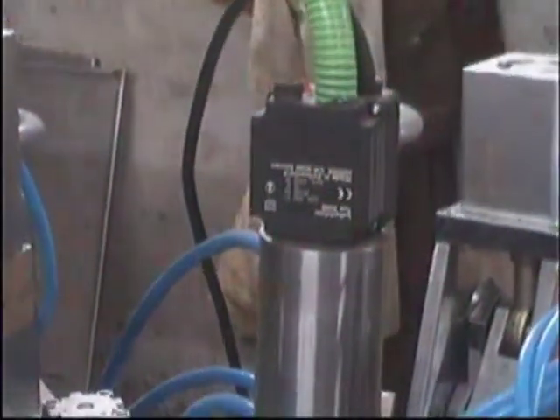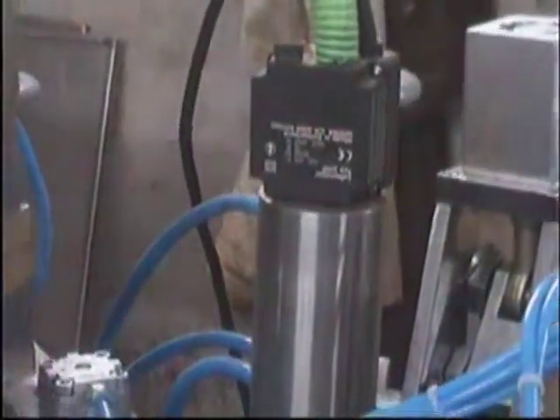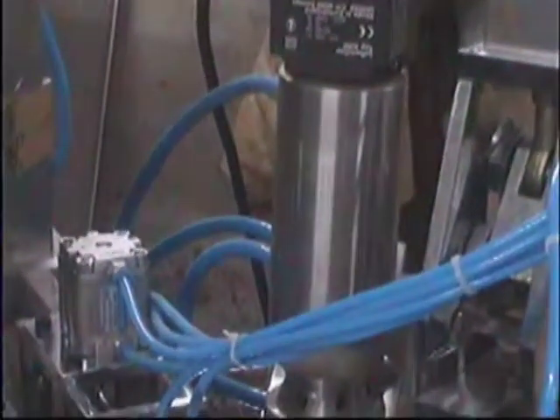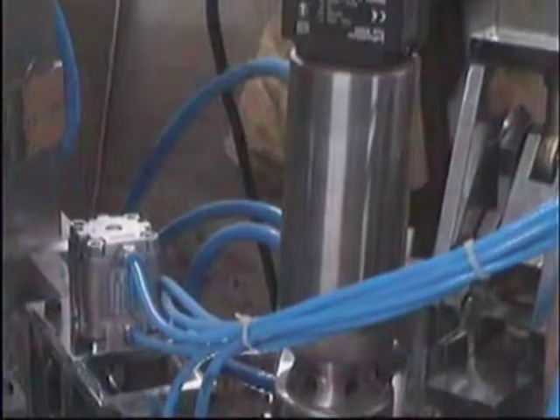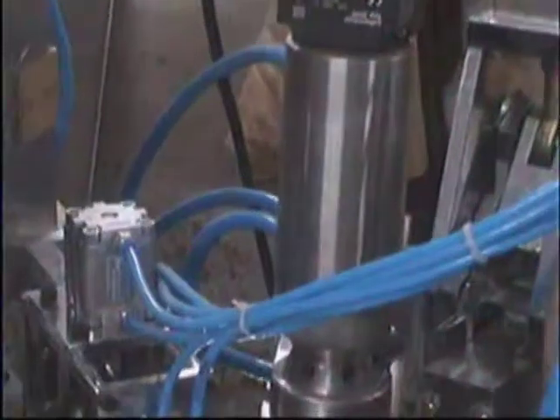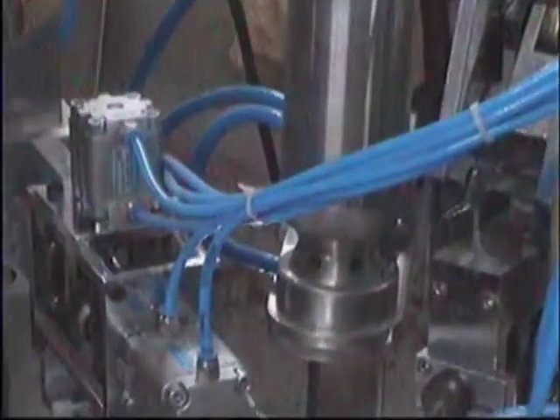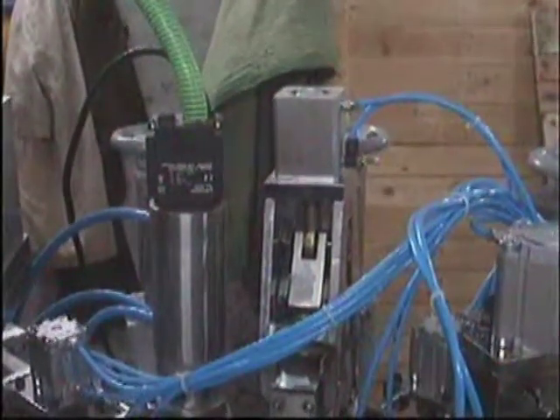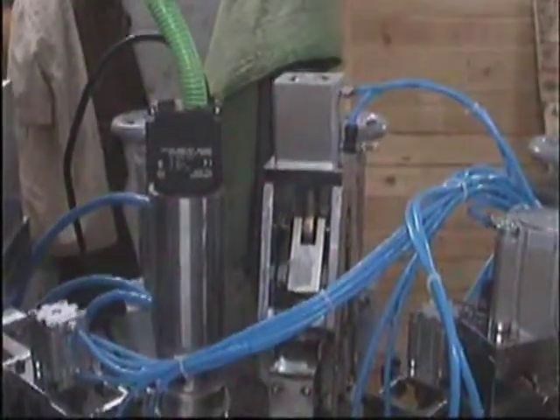This is the heating tool, which can give you a temperature from 0 degrees to 600 degrees centigrade. In the center you are seeing the water jacketed arrangement, which ensures that the tube does not collapse while getting hot. This is the crimping sealing of the lami tube.